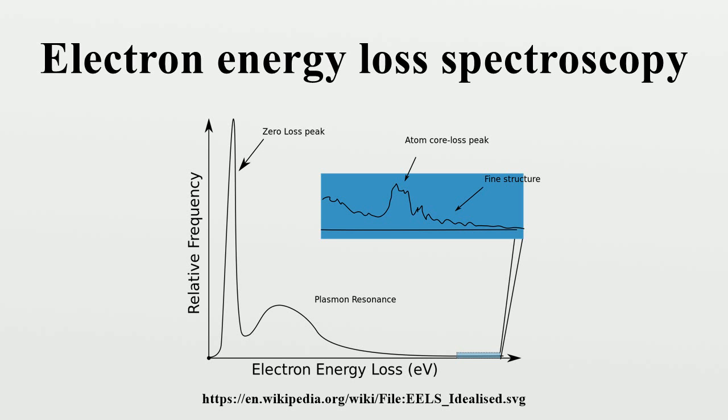Pressure measurements. The intensity and position of low-energy EELS peaks are affected by pressure. This fact allows mapping local pressure with ~1 nanometer spatial resolution. Peak shift method is reliable and straightforward. The peak position is calibrated by independent measurement using a diamond anvil cell.